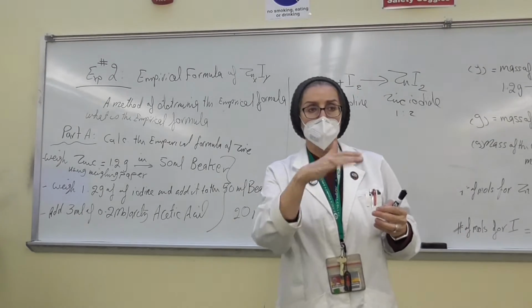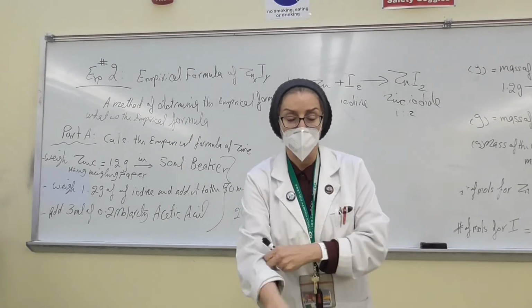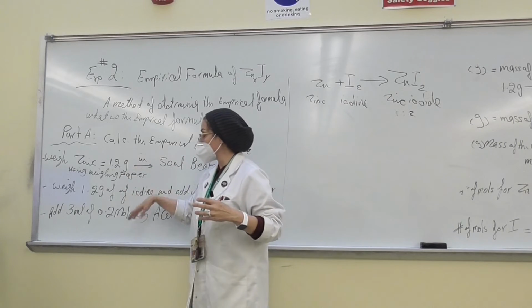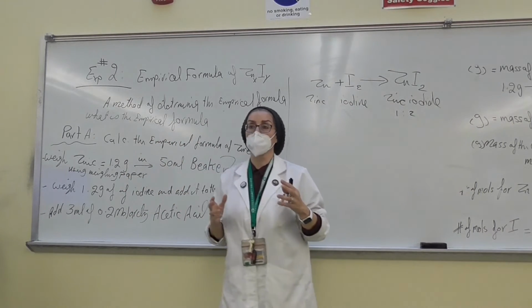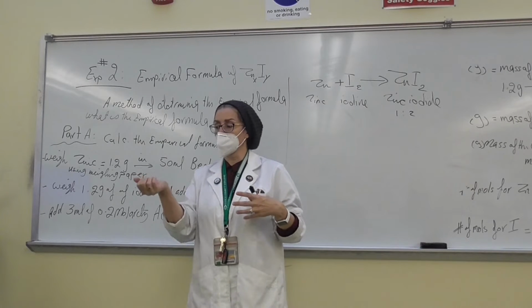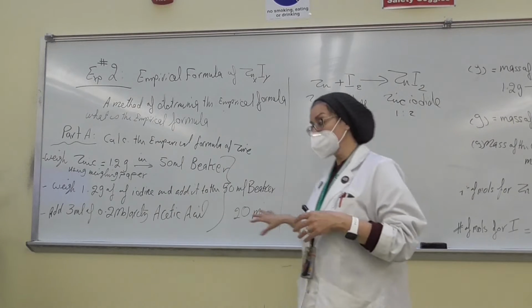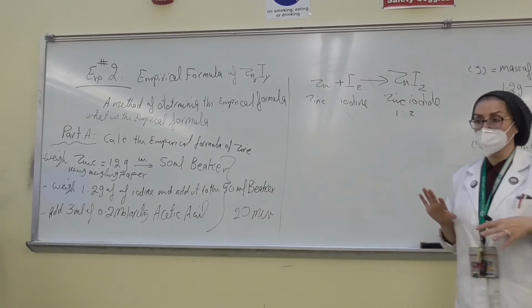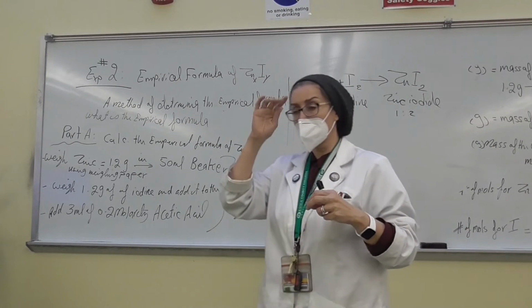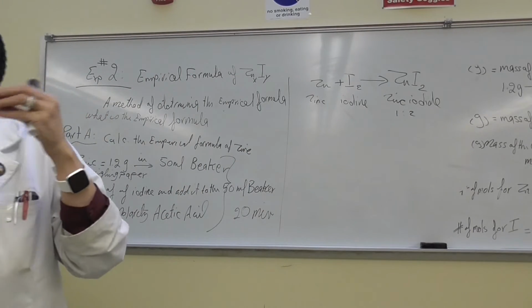Wait for the reaction to happen. Sometimes a student was telling me, oh, it did not change in the temperature. Temperature will be raised because this type of reaction, when you mix them with the acid, is an exothermic reaction. So it is going to produce heat, and you can feel it in the bottom of your beaker. Wait for 20 minutes, and then after you finish 20 minutes, you're going to see a dark, maybe brownish, mahogany, something like that, color.